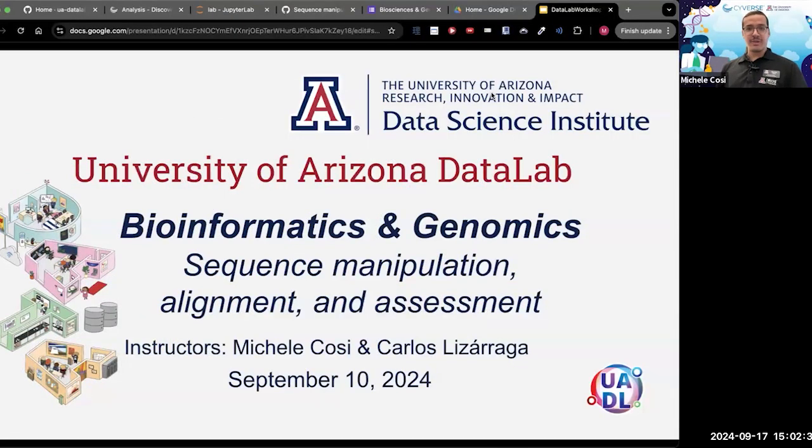Thank you, and welcome to week 3 of the Bioinformatics and Genomics workshop series. Today, we're going to be focusing on sequence manipulation, alignment, and a little bit of assessment.